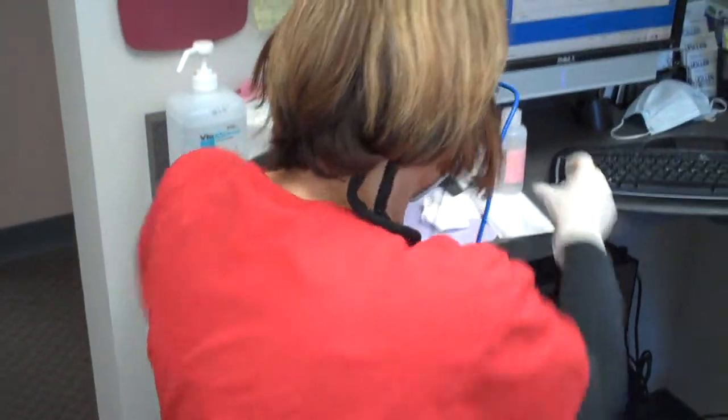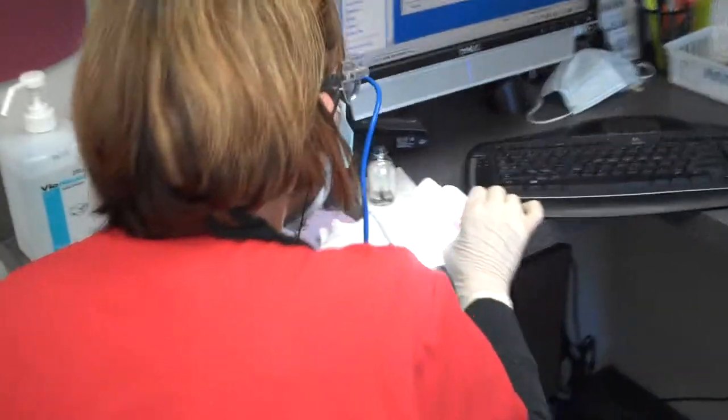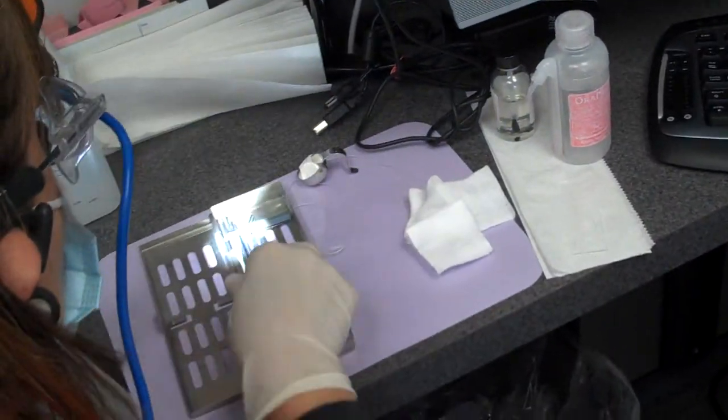I'm going to be taking a plaque sample on our patient, Gwen. To do this, we place a little bit of isotonic solution on a glass slide.